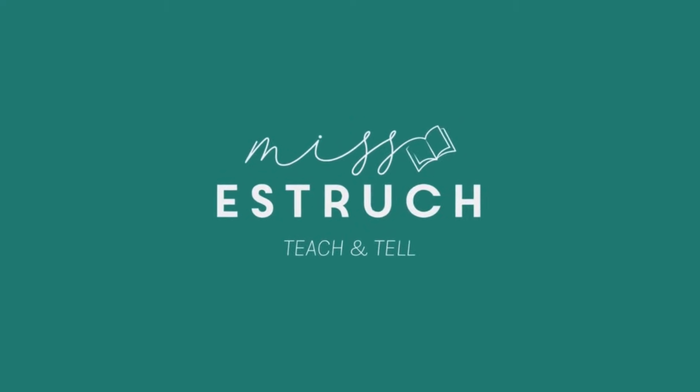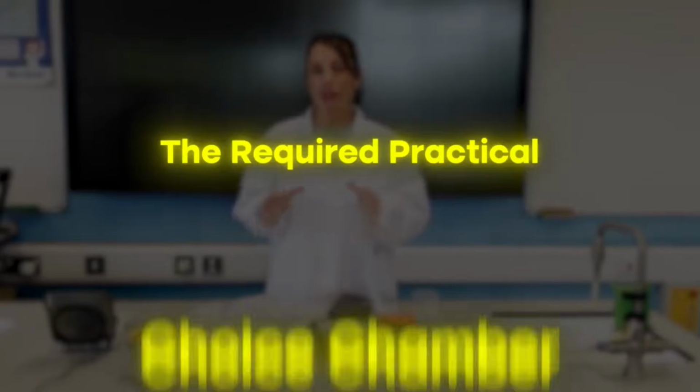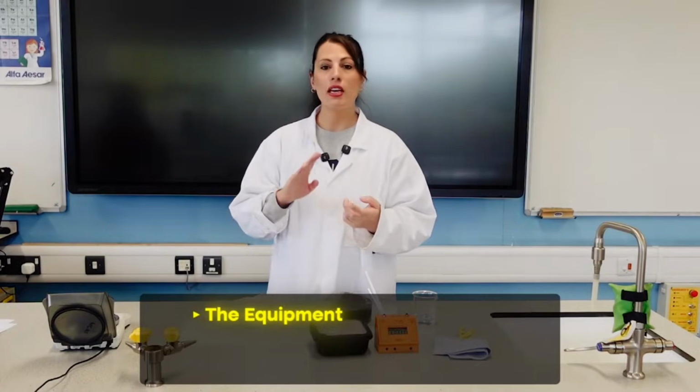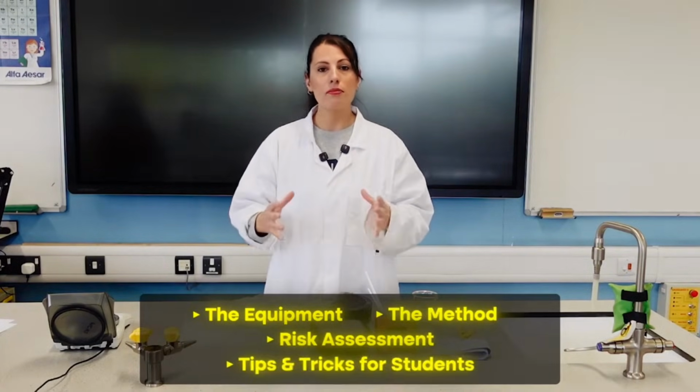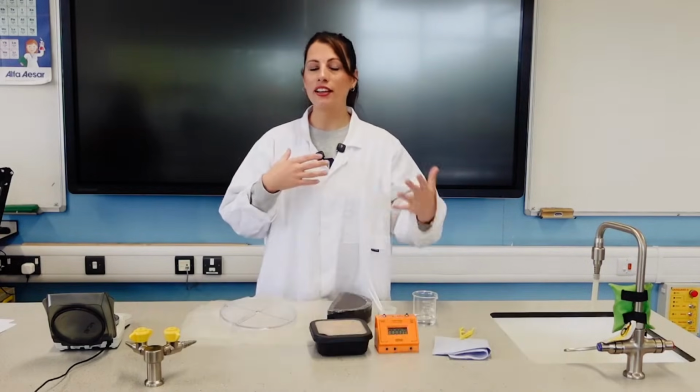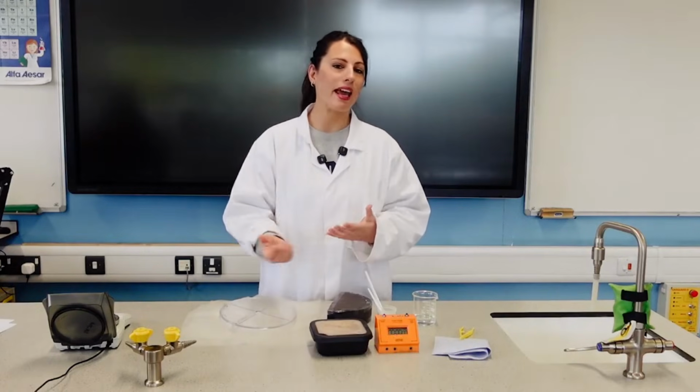Hiya, and in this video, we're going to be going through the choice chamber required practical for A-Level Biology, and we're going to be using maggots. I'm going to be talking you through the equipment, method, risk assessment, tips and tricks for the students to make sure that they can get the best set of results possible, and the sorts of things you might want to show them and explain as you go through.